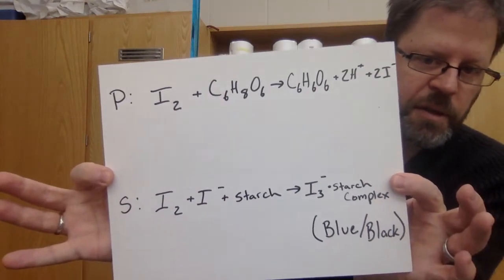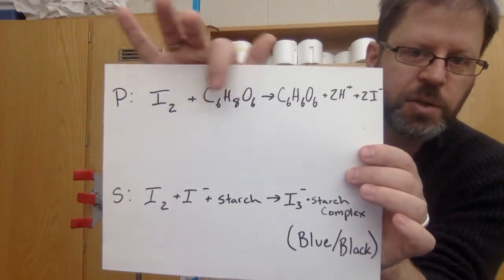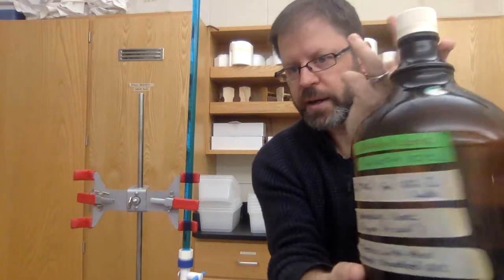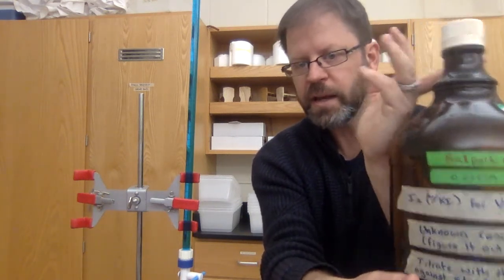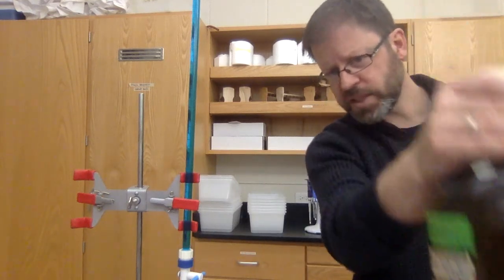Here's the reactions that we're doing. You need to know that it is 1-to-1 between vitamin C and I2. You need to know the molar mass of this. Okay, this was in molarity. Okay, 0.005 molar, and of the I2. I will tell you, we have been off by a factor of 2 in some years with this stuff. This stuff is really finicky, which is part of the reason why we go about it this way.